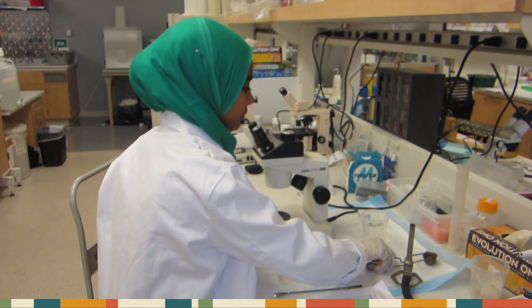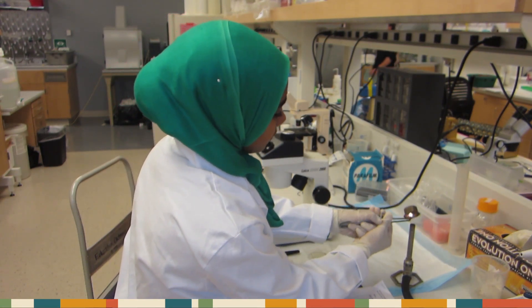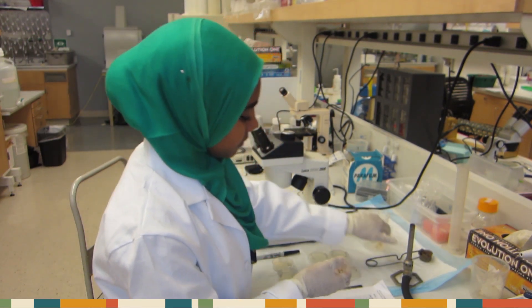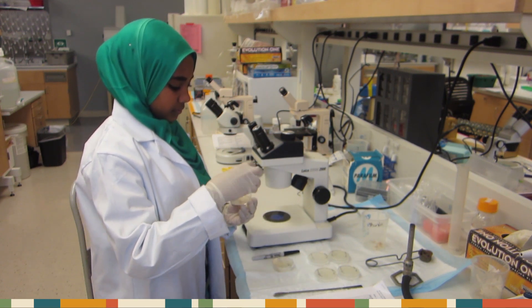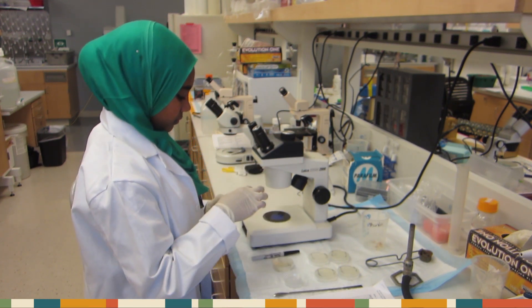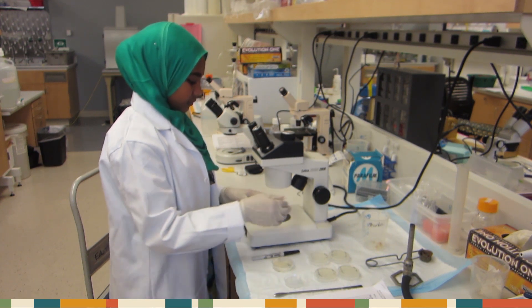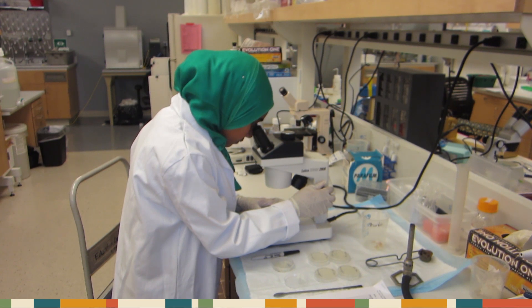First, you light your Bunsen burner. Then, you remove the lid off of your wild-type worms. Place the plate under your dissecting scope and turn the bottom light on. Adjusting the scope as necessary, find the most populated region.